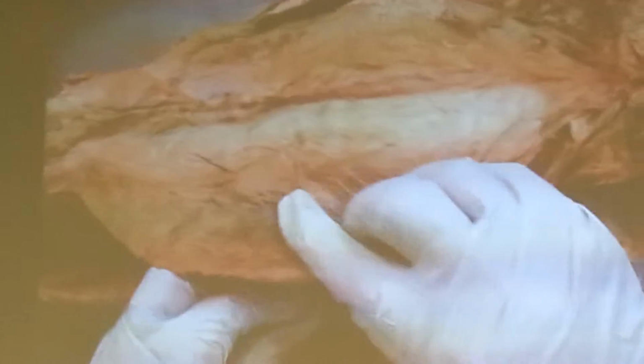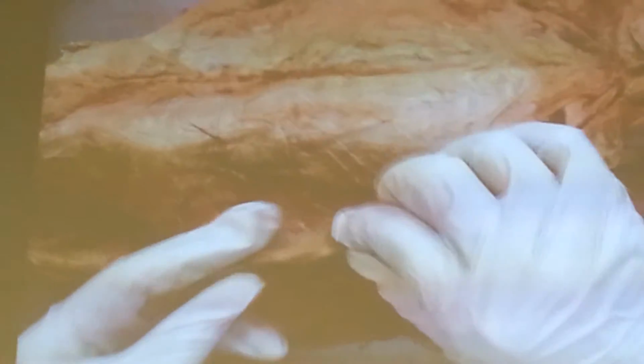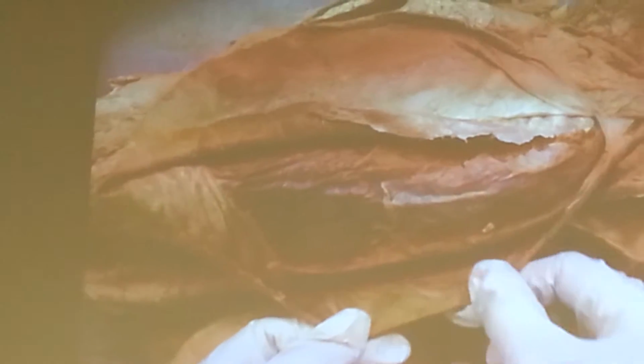And the rest of that also is external oblique muscle. So we put one flap of external oblique here, and this is the rest of the external oblique muscle, right? We put this one away.